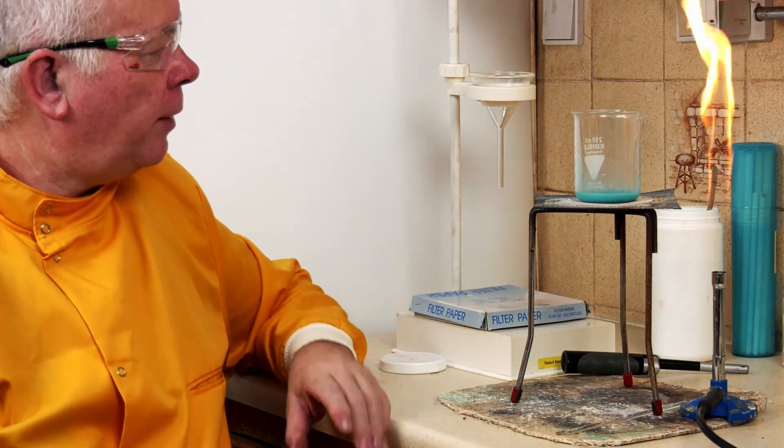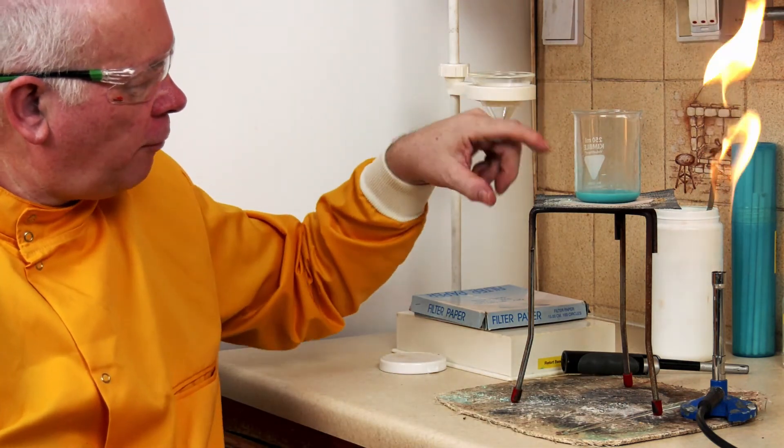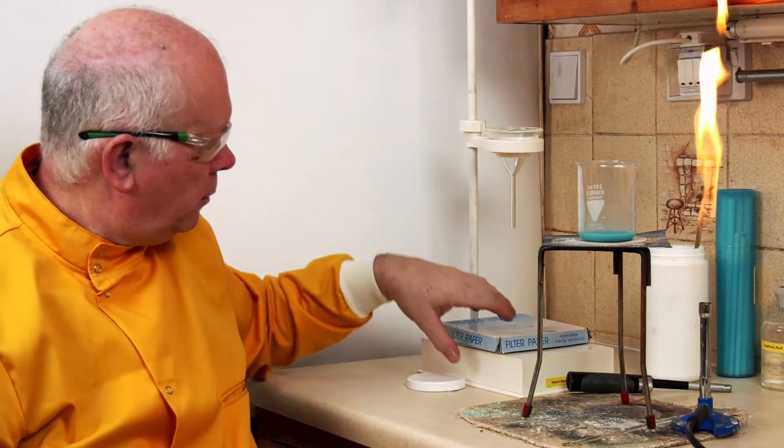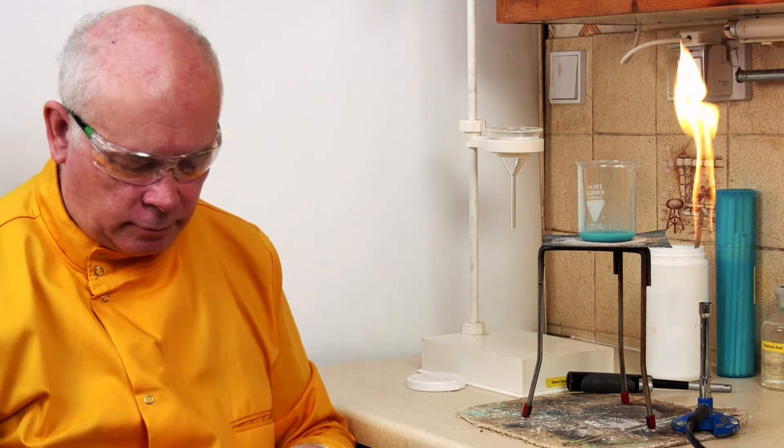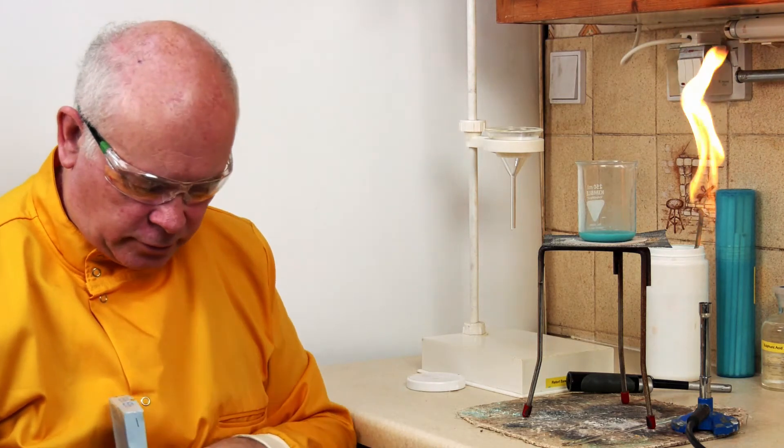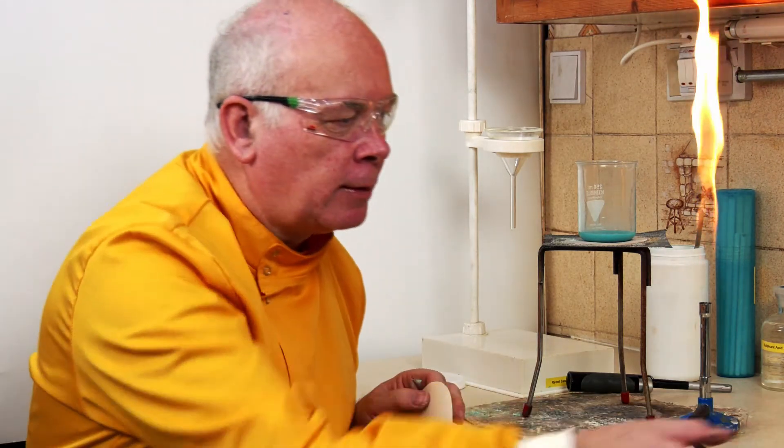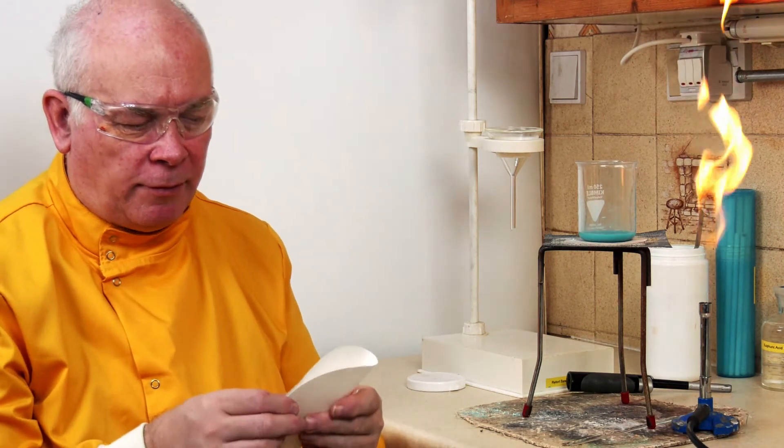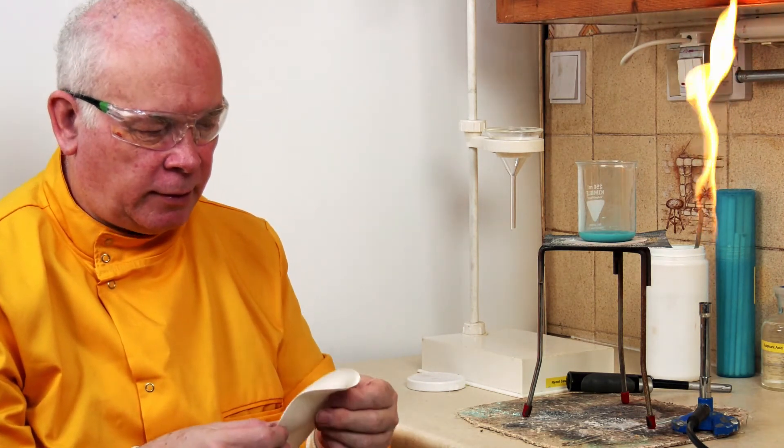Our next job then is to filter off all this extra carbonate that's unwanted in the experiment. Now, if I'm going to do a filter, then let's take a piece of filter paper. There's several ways of doing this.